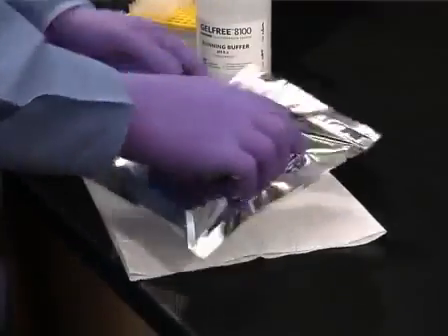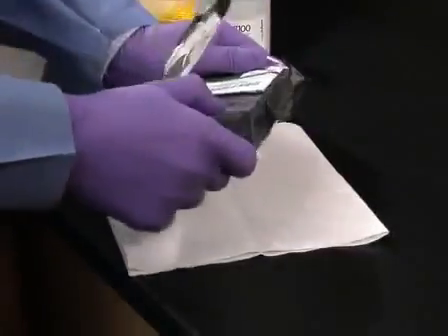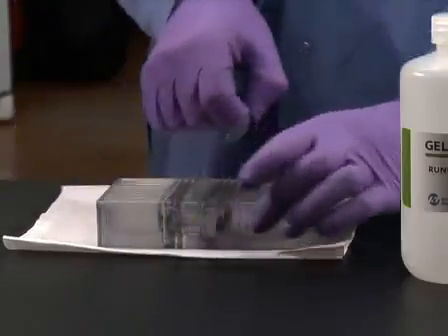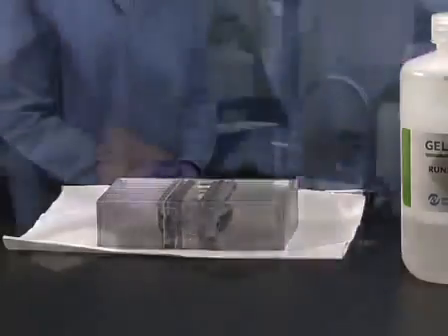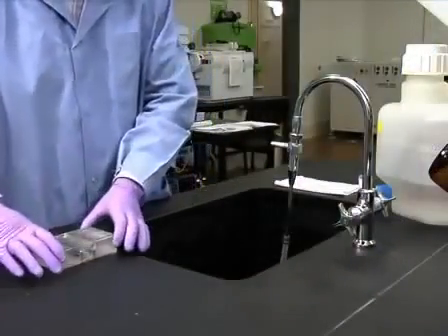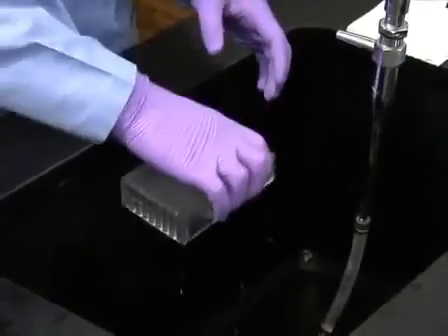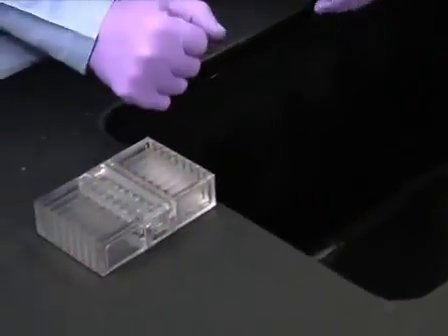Allow the heated samples to cool to room temperature. While the samples cool, remove the gel-free 8100 cartridge from the foil pouch. Remove and discard the plate sealer. Remove the storage buffer from the cartridge compartments using a pipette. If all eight chambers of the cartridge will be used, invert the cartridge to drain the storage buffer from the compartments.